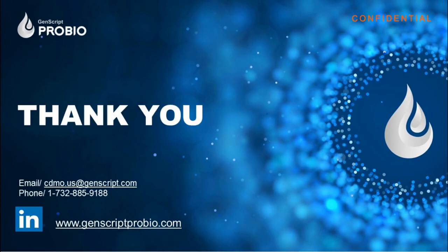Fantastic. And what are the main challenges of scaling up lentiviral suspension production processes? I think going from the upstream to downstream, in the upstream process, you have to strictly control your transfection step. One of the things that needs to be taken into consideration is the transfection reagent and plasmid mixing time, for instance, how long you incubate and what the incubation conditions are.